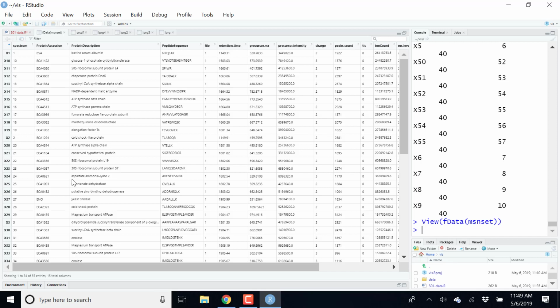So this does not correspond directly either to this long or this wide data set. The quantitation data corresponds to a wide data set, and these data sets correspond to typically long data sets. But the point I would like to make is that these data are also tidy.